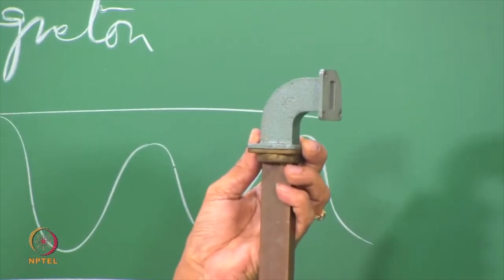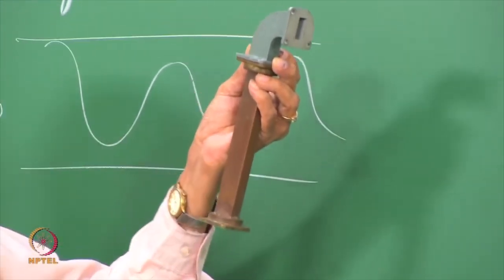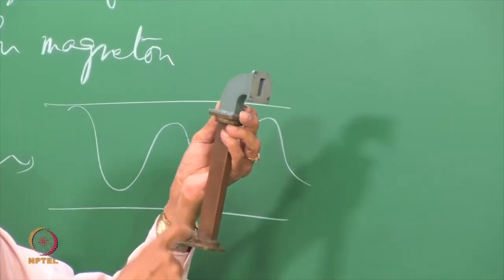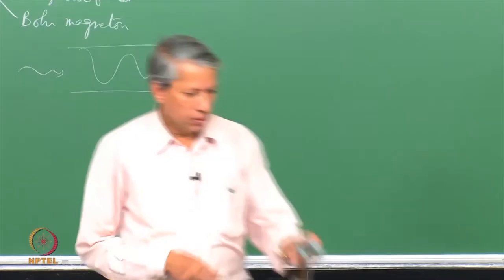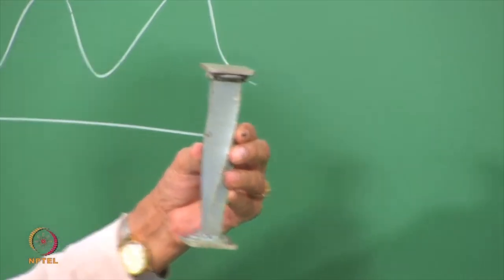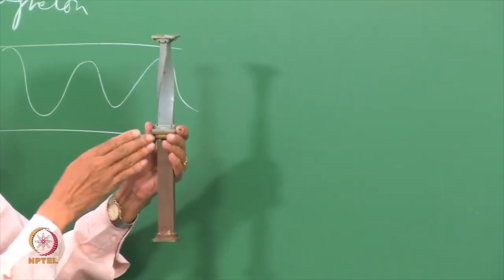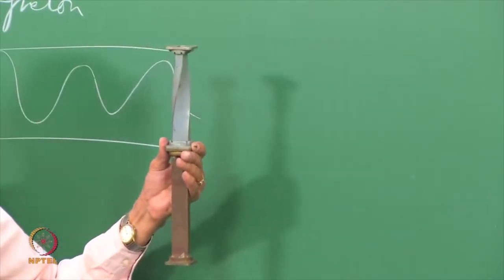so that is possible. But you see here, because of the rectangular nature, the radiation will have certain polarization. That is, there will be specific orientation of the electric field and magnetic field inside this tube. So, when you want to change the orientation, there is also a tube available which is called the twist here. Here again, see the plane of radiation enters here and gets twisted and then becomes perpendicular to that.